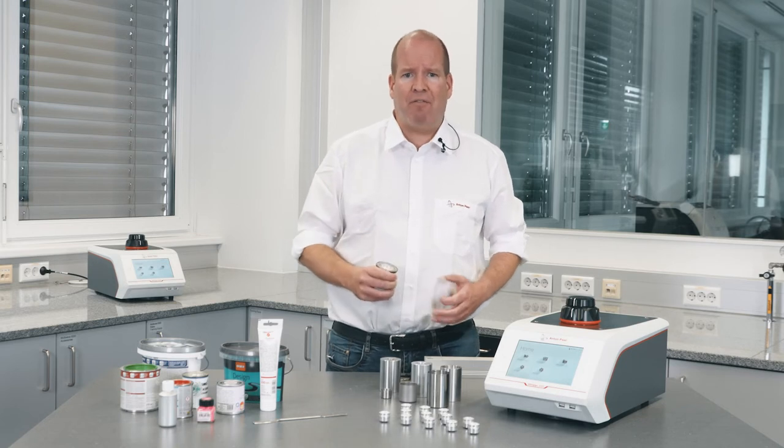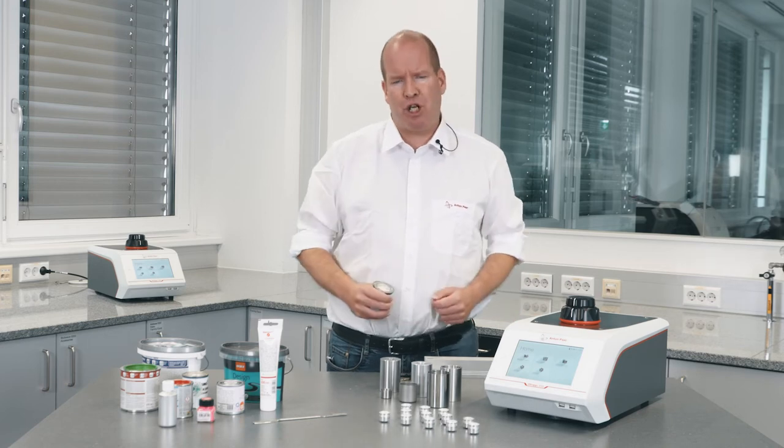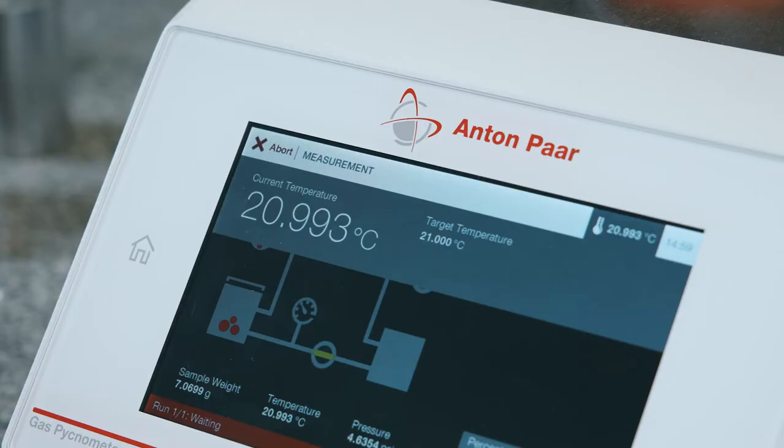Does the density of paint depend on temperature? Absolutely. The built-in Peltier temperature control offers temperature stability better than plus or minus 0.05 degrees centigrade, with a temperature range from 15 to 50 degrees centigrade — the widest on the market.